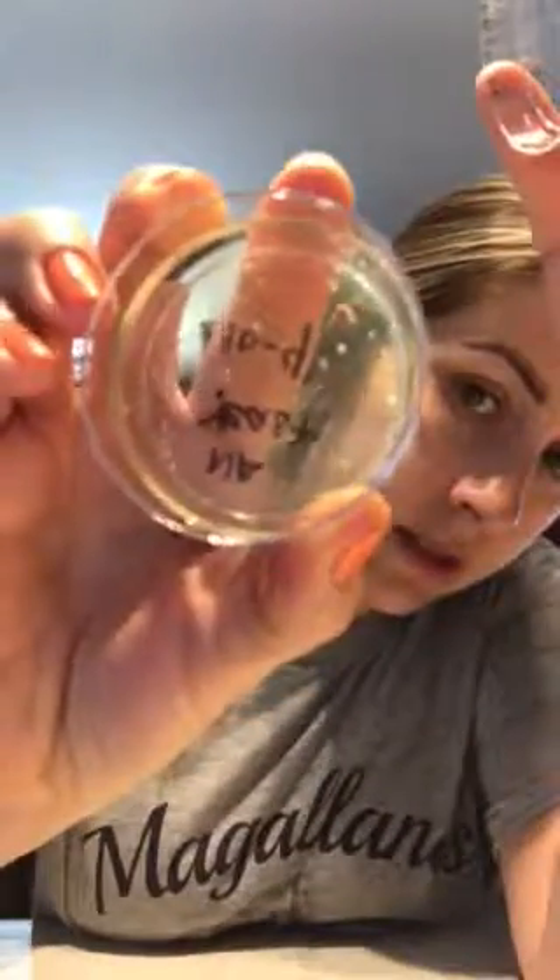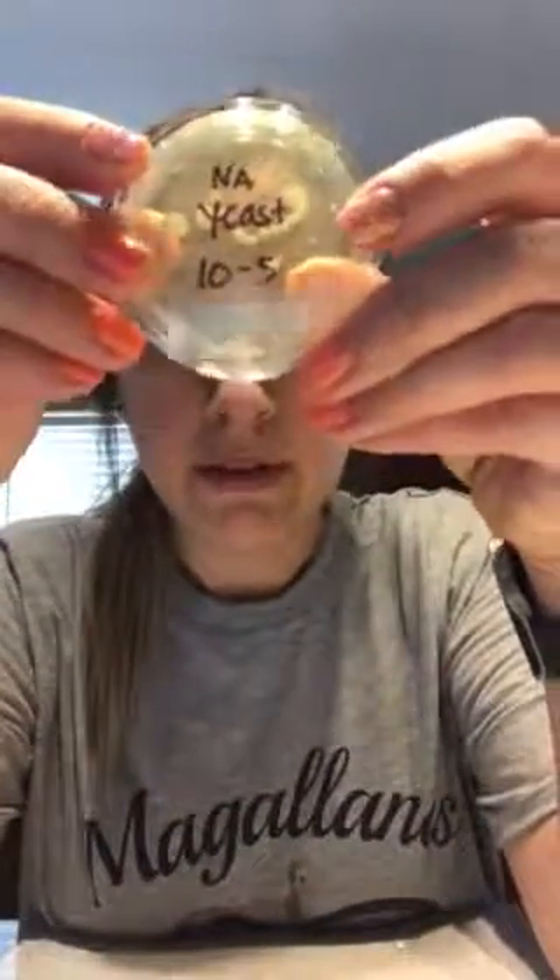The ones that were viable are 10^-4 — I have little dots there from counting the colonies. If you look at it you can see all the colonies, and there are more than 30 and less than 300. I counted 213 for this one, so that was a good, viable count.